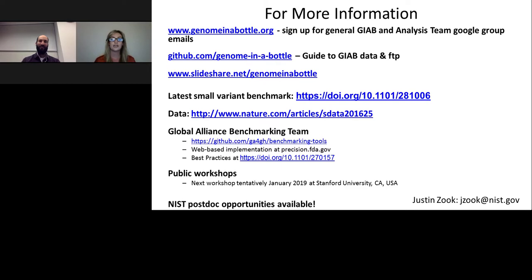Our next question is, can anyone participate in the manual curation of SVs for Genome in a Bottle? Yeah, so we definitely are happy to have anyone participate in this, regardless of your expertise level. And so we plan to have some sort of training that you can go through, or some example sites that you can look through to understand how best you can understand the different types of visualizations that we give in this web-based app.